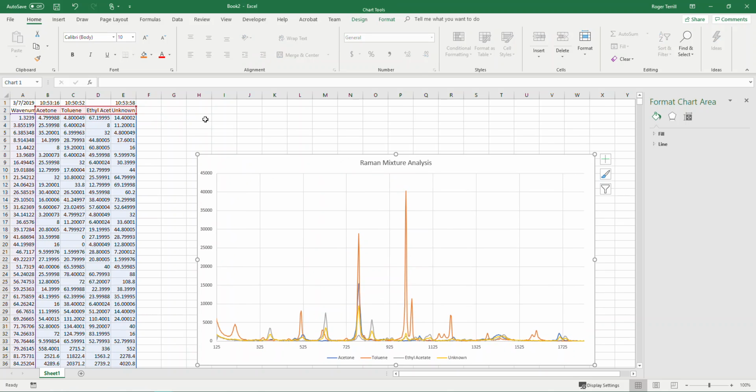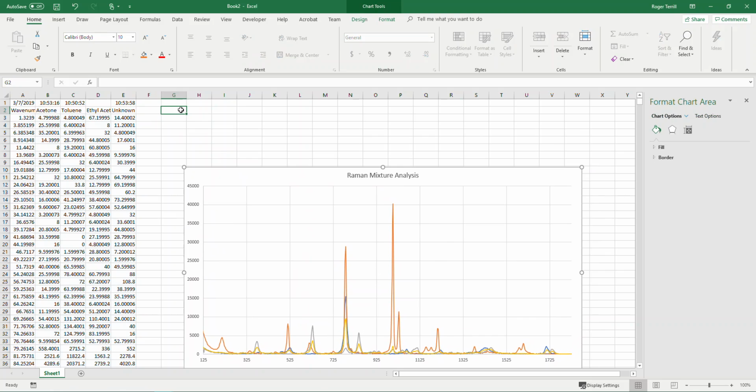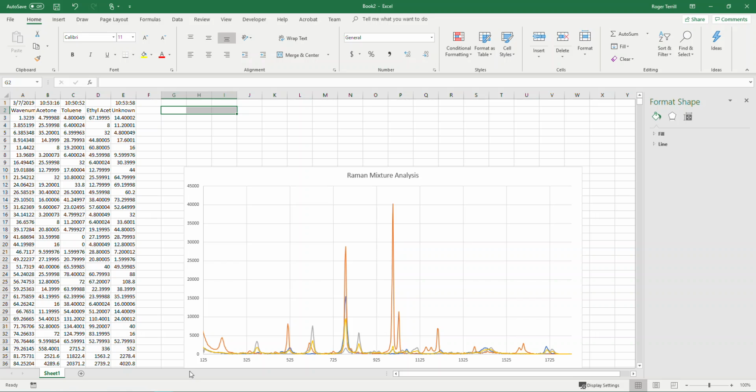So let us work on that. So let us take 1, 2, 3 columns, one for each coefficient that we want. And do we want an intercept? No, we don't want an intercept. An intercept would add a constant offset to the mix, and that's not going to be helpful to us, right? That would be sort of a non-physical thing, right?